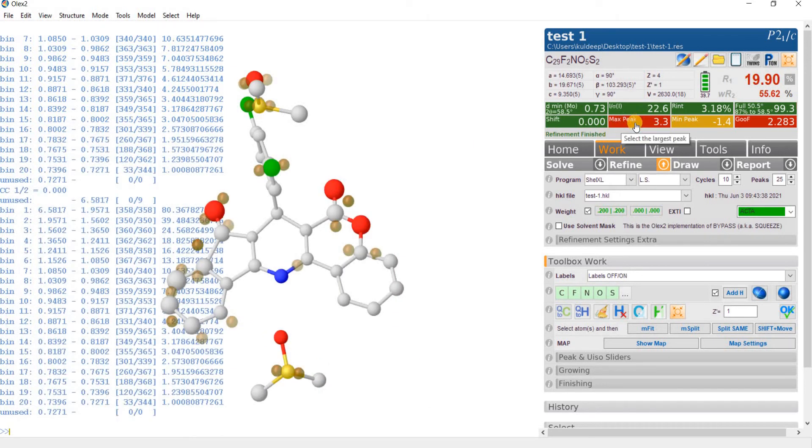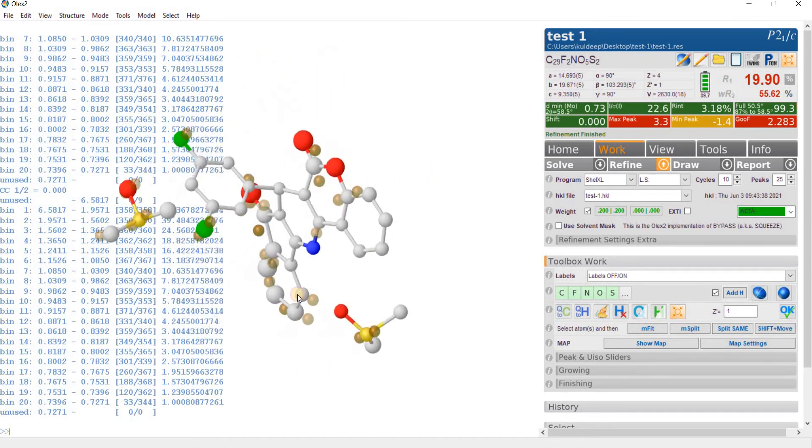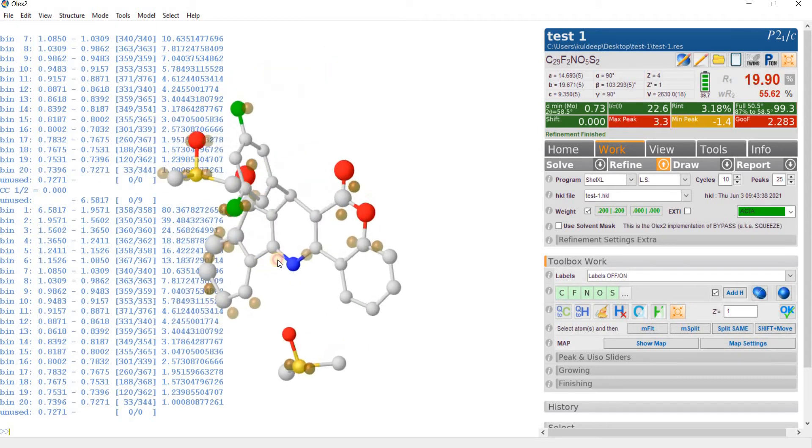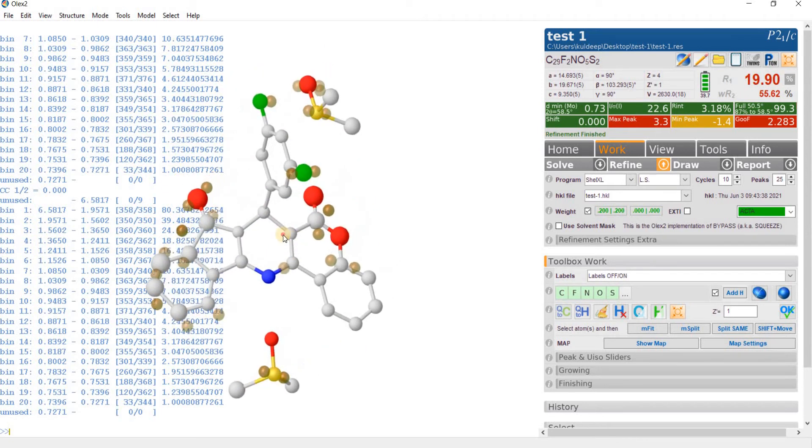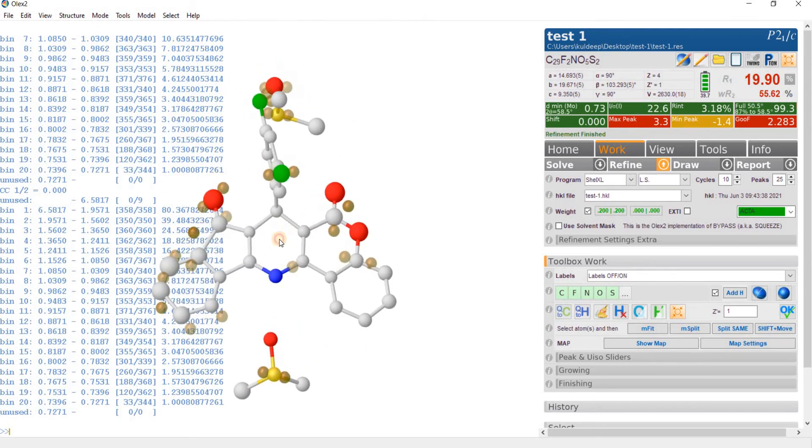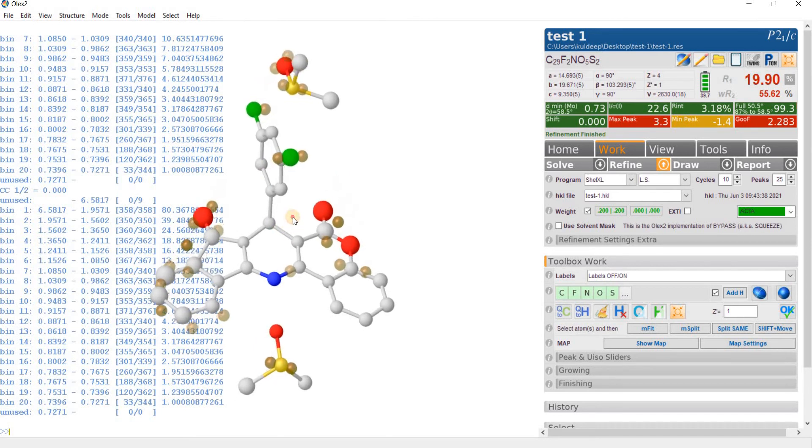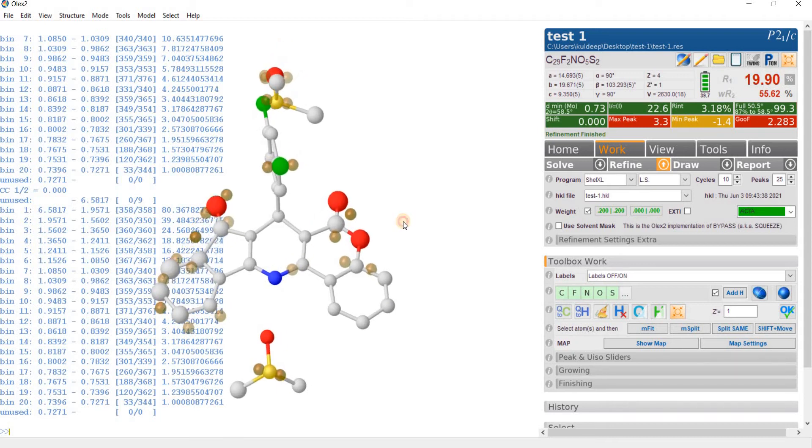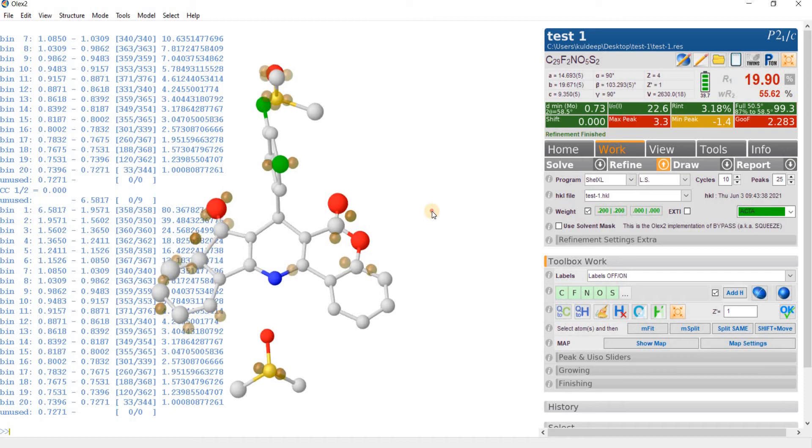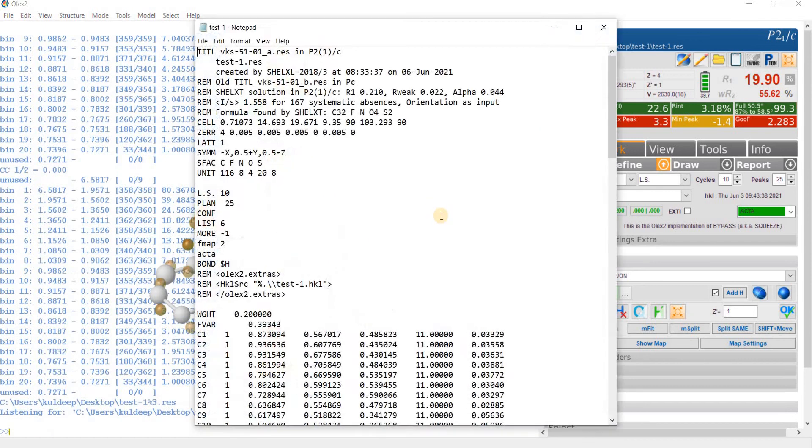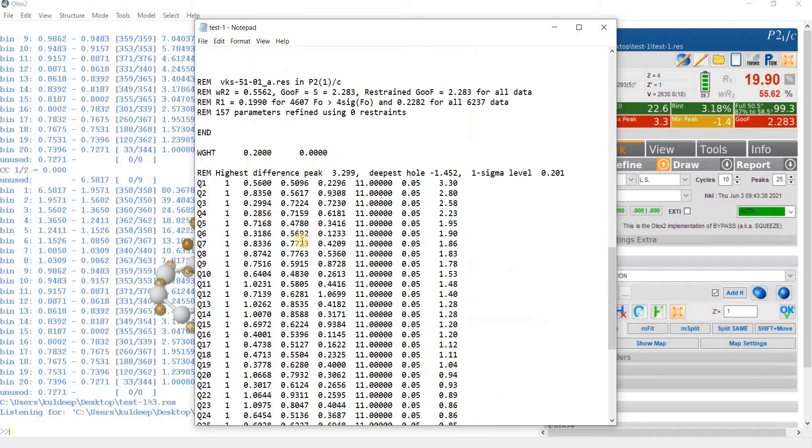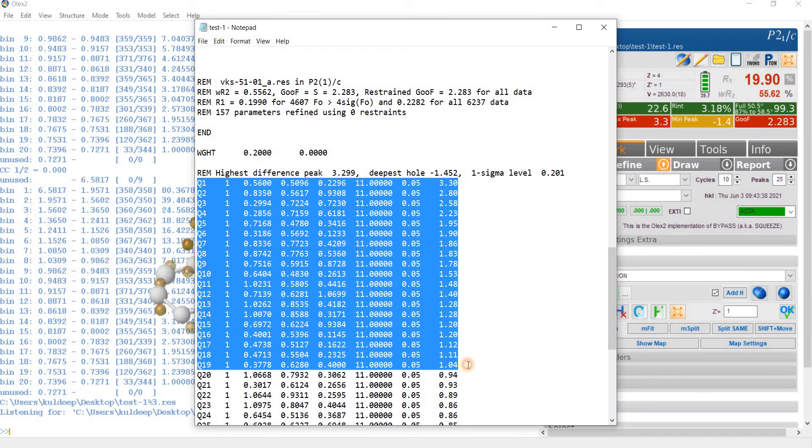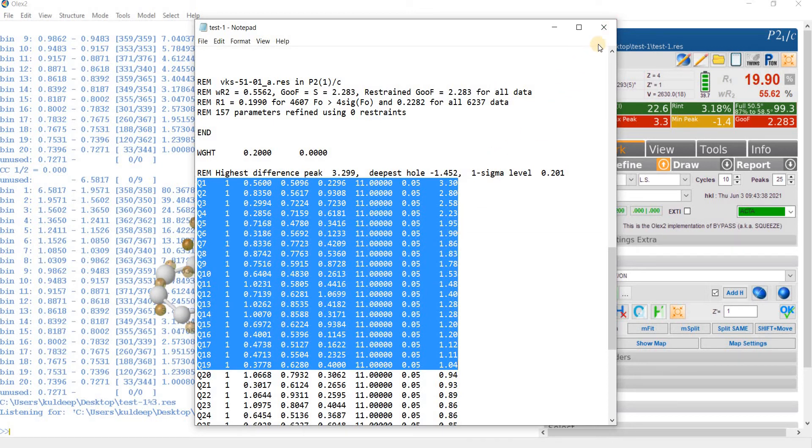The maximum Q peak with intensity 3.3 electron. So up to now everything seems to be good, but if you look carefully at the Q peak intensity, you are getting a number of Q peaks with intensity greater than 1 around the 5 and the 6 member ring. If you look at the Q peak intensity from Q1 to Q19, these densities are higher than 1 electron. So we have to take care of this electron density.